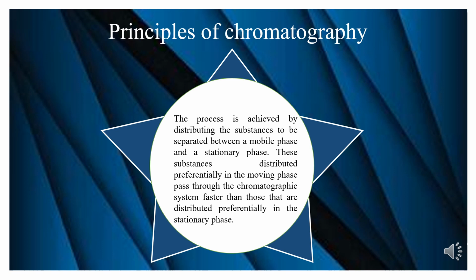Each sample component elutes from the stationary phase at a specific time called the retention time, and as the components pass through the detector, their signal is recorded and plotted in the form of a chromatogram.